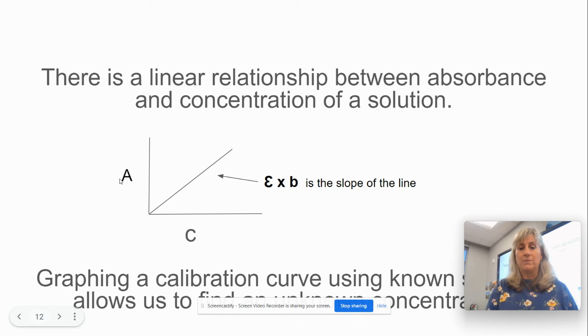A graph of absorbance versus concentration will allow us to then get the slope of that line. And that E is the molar absorptivity constant that relates concentration to absorbance for that particular ion, so for the colored copper +2. And just a little bit of background.